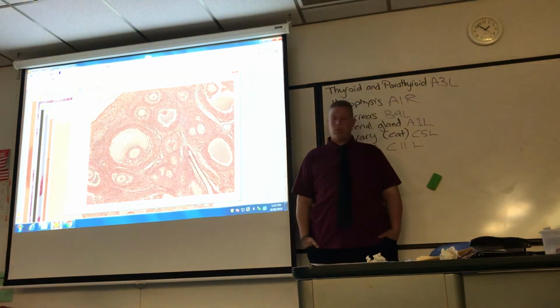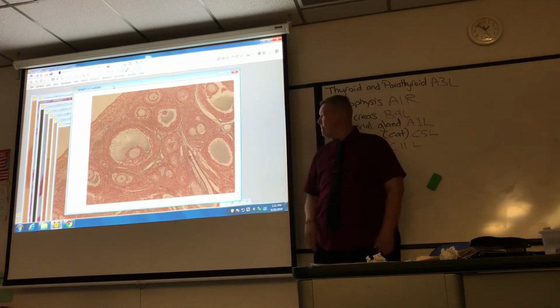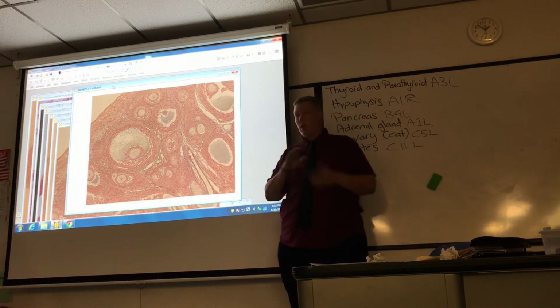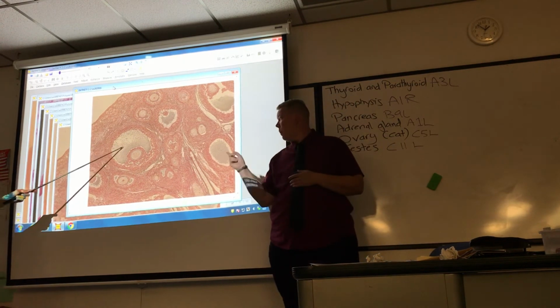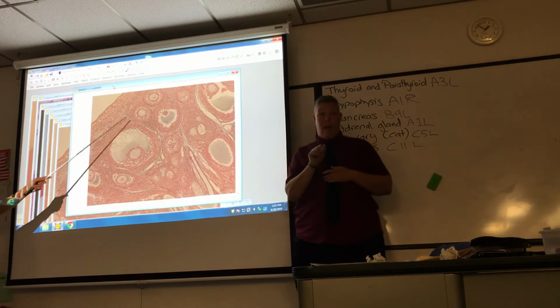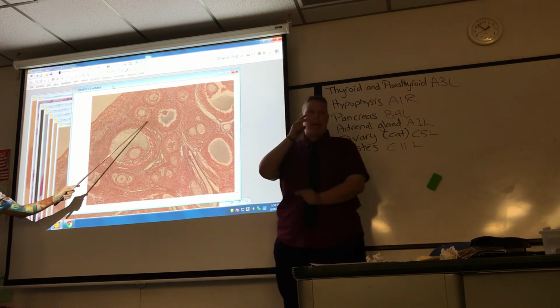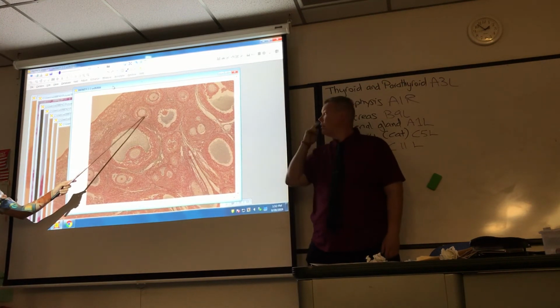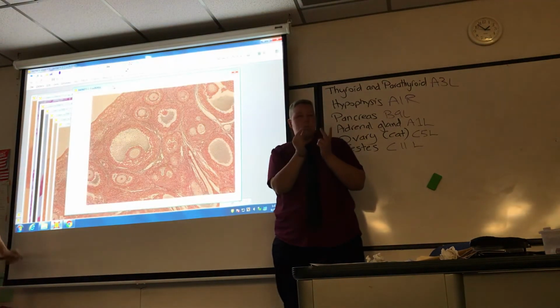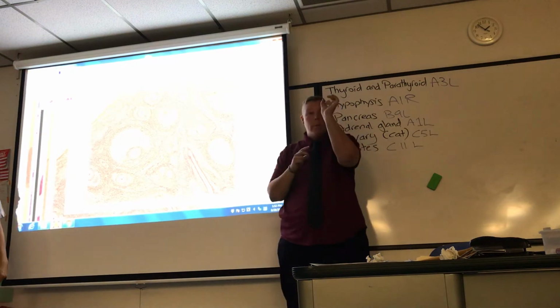All right, it's pretty good. Take a picture of this. Okay, that's a nice Graafian. Right there. Okay, there's the moon-shaped antrum. So if that's Graafian, what is this one and this one? Secondary. I see the oocyte. I see little pockets of fluid. Okay, yeah, that's what I see. Again, all of these primordials. Okay, so yeah, that's good enough.